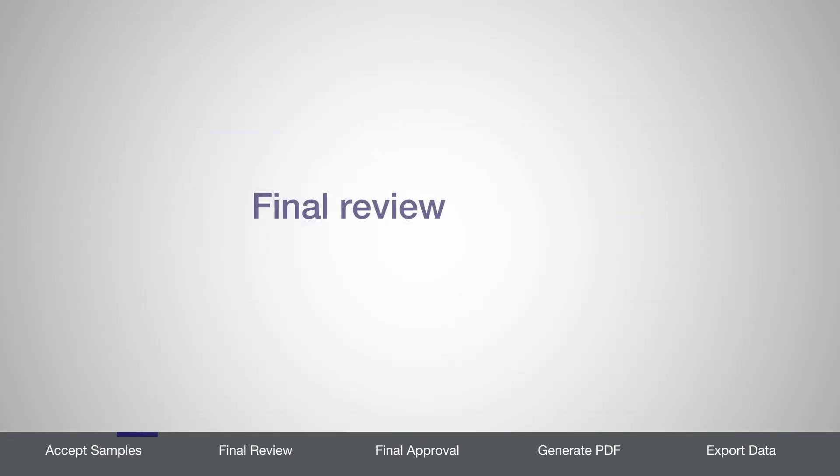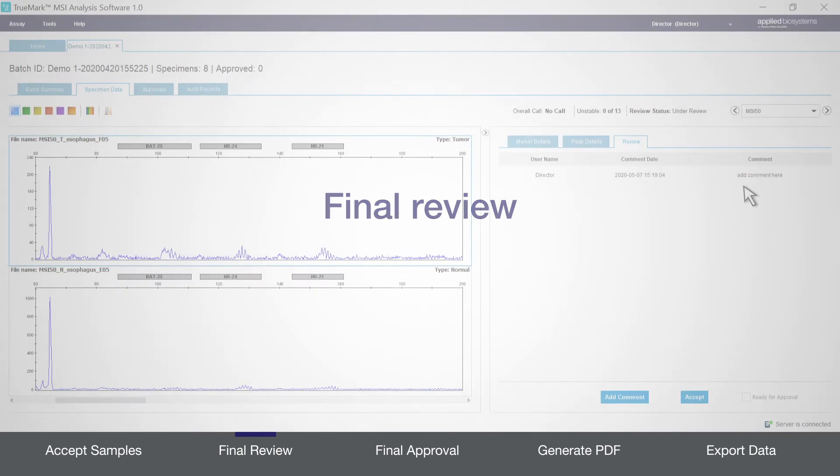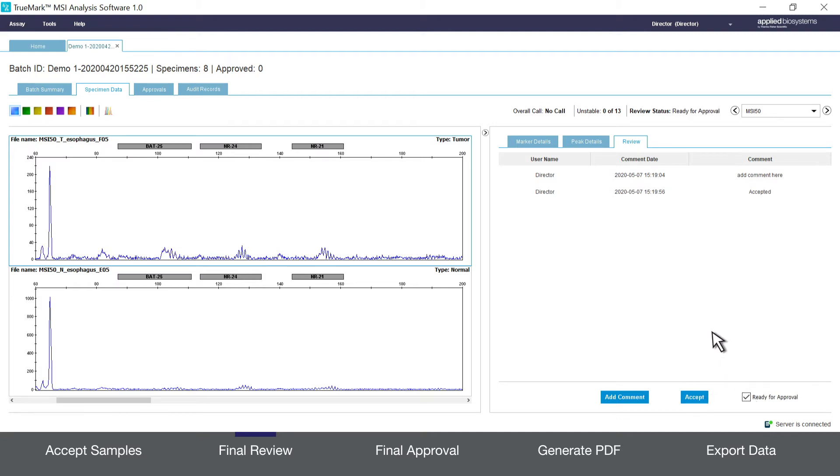After all comments have been added and samples have been accepted, a user with the appropriate permission can do a final review of each sample and then check the box next to ready for approval. So here I've added my comment. Now I will click accept to accept the sample and then check the box next to ready for approval. This then changes the review status to ready for approval.